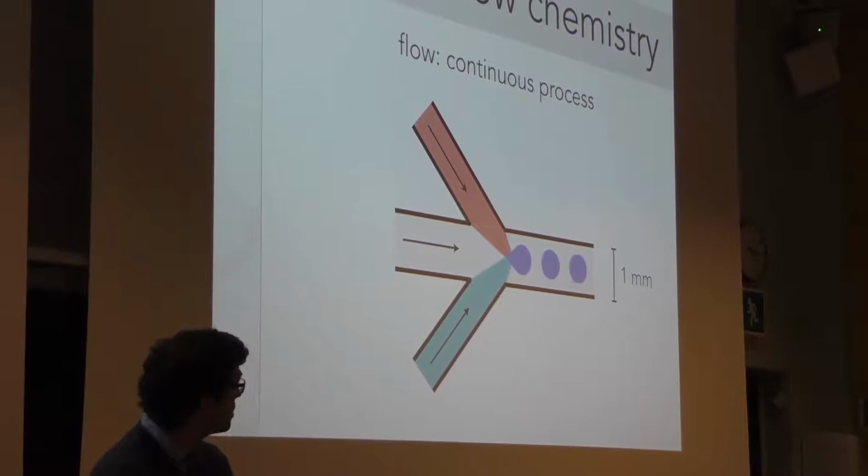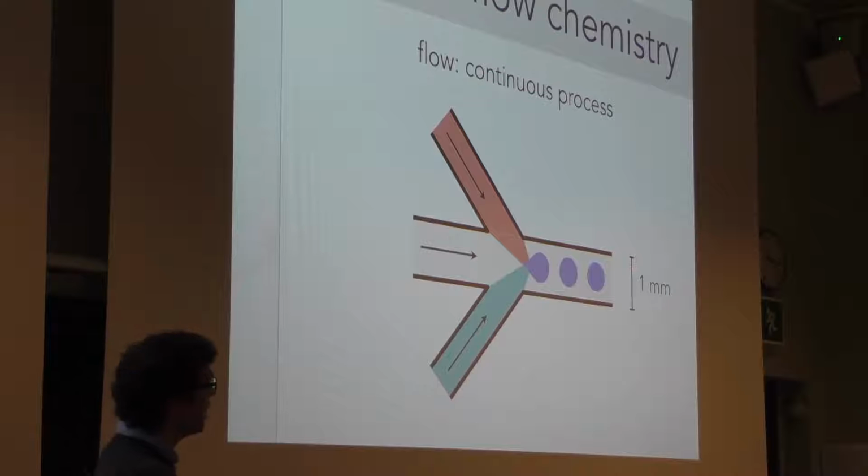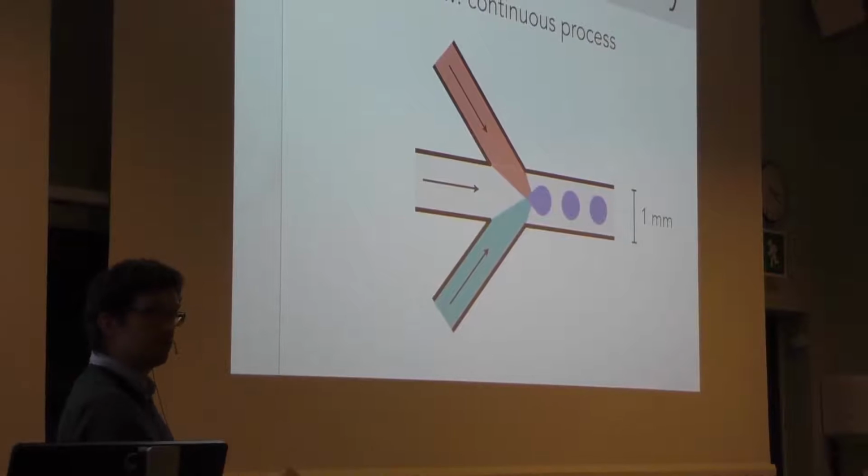And this causes the formation of droplets. So again, we're using 1mm channels for all our reactors, and so these droplets are relatively large, so 2 to 3 microliters in size, but we can produce droplet streams that are stable for meters on end in these channels. And so all the work that we do is with PTFE channels, so this matches up with the PFPE carrier oil that we use. So we get preferential wetting of the oil to the channel wall, and our droplets never touch the wall, and then they never foul, and our reactors can keep going indefinitely.